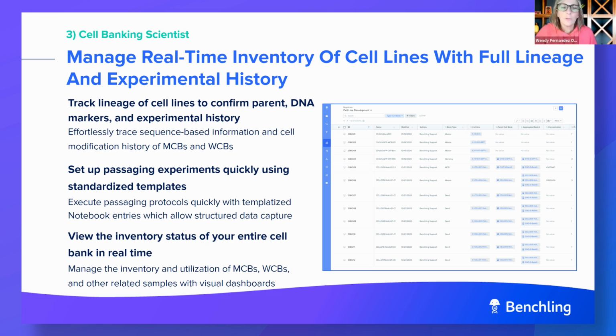This cell is responsible, as we said, of expanding cell banks and setting up passaging experiments. And ideally, these activities are standardized and the team has templates they can use for the process. And the team needs to keep track of the physical inventory. So what a better way to do this than visual dashboards that give this team a real-time picture of the entire collection and the status of the banks. So let's see how Benchling supports this part of the work.